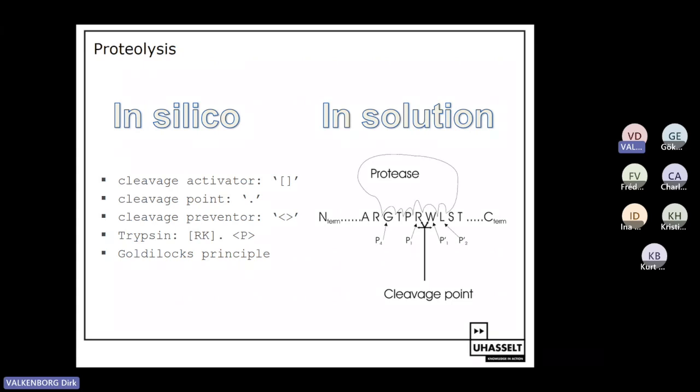And we also already have a basic amino group at the N-terminus. So that one will also most likely attract an additional charge. So we have doubly charged molecules most of the time when we do electrospray ionization in combination with trypsin digestion. And that's a good thing, as we will see later on when I talk about fragmentation spectra.